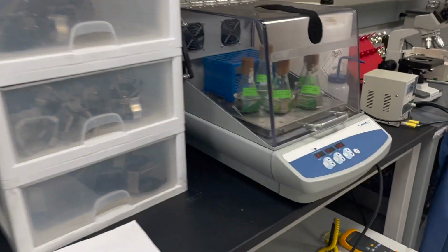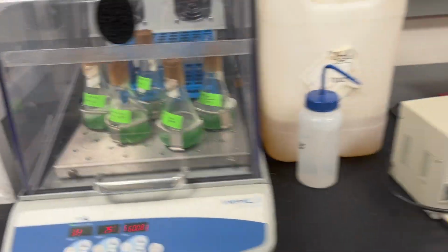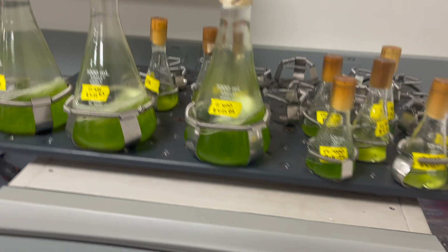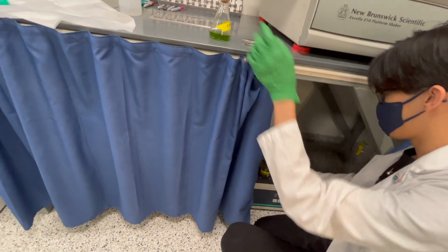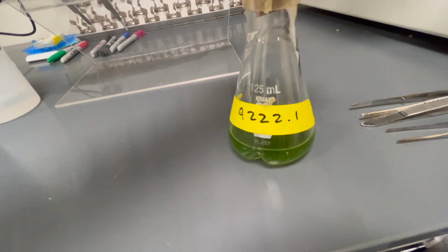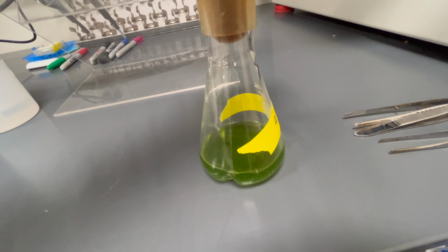Although glass bead transformation is a common transformation method for those working with C. reinhardtii, there are many factors that may be contributing to negative results. Firstly, it's important to ensure that enough cells are being used in the transformation. Our team transformed cultures of C. reinhardtii after an average of 5 to 6 days post-inoculation, or until the culture was a dark, rich green.